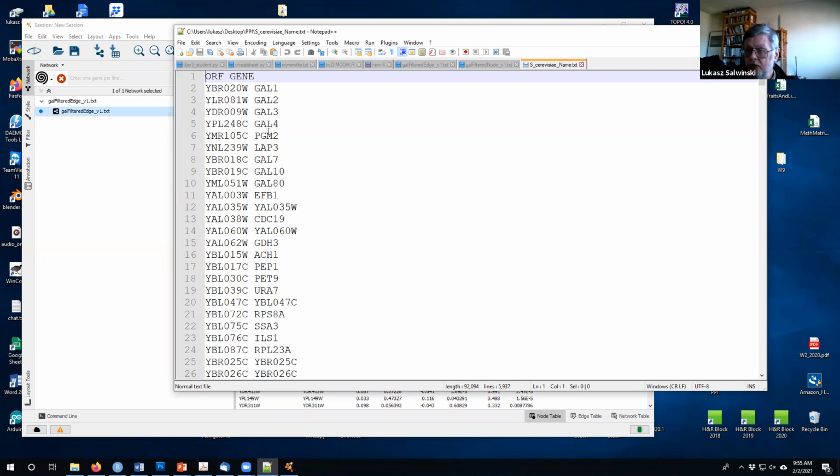Those are more meaningful, more human readable versions of the gene names. In some cases, there's nothing meaningful available. This is probably because this was a gene discovered when the genome was sequenced and wasn't characterized at that time. So nothing is known. It hasn't been discovered in any other way. So the meaningful name is not present, so then this formal name stays on.